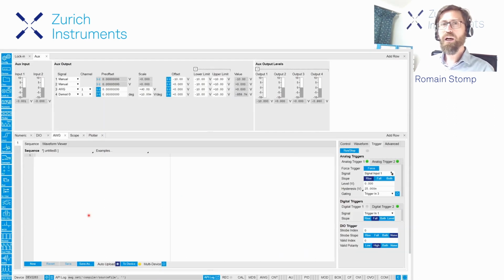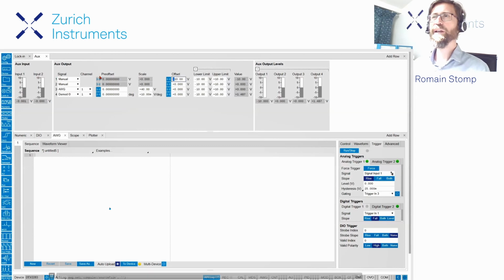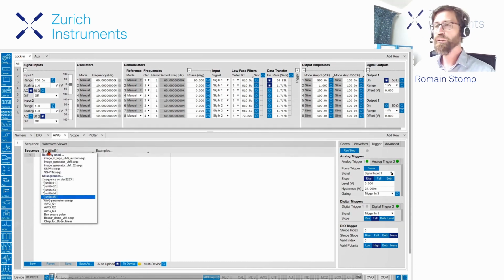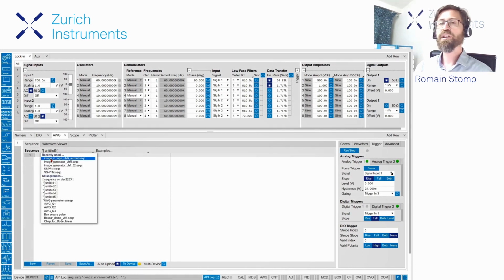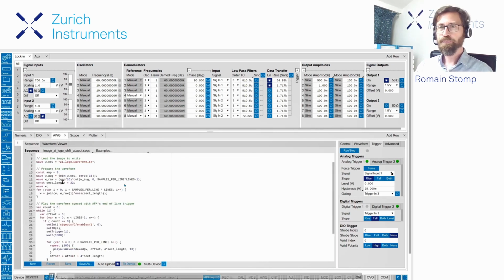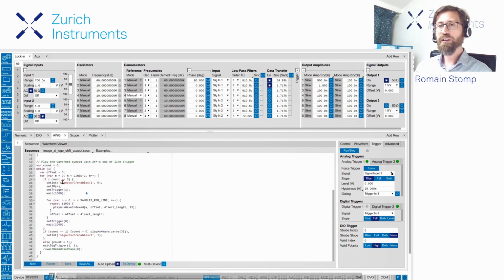Okay, so let's see now how this looks in some of these terms. So if I turn this on, I have to remove the laser pointer so that I can eventually stop. That's a video graph from the Lab1 interface. We started with a minus 10 volt DC offset, because we wanted to start with something very flat so that you see that there was nothing written before. Then we load our AWG program. We'll go back to that a bit later.